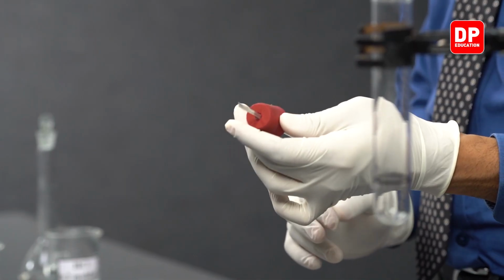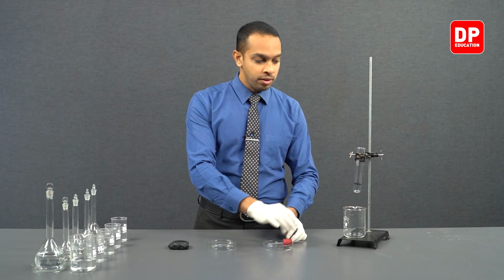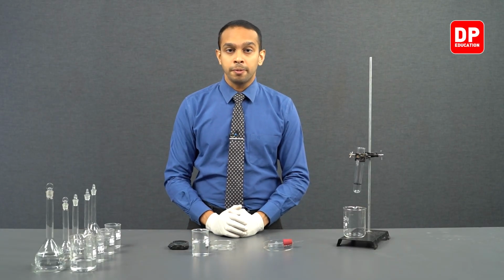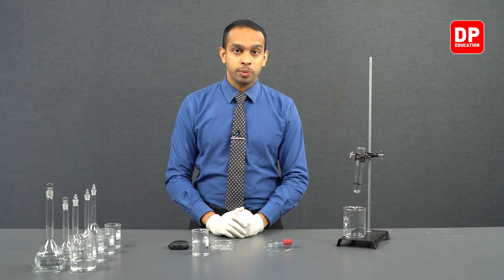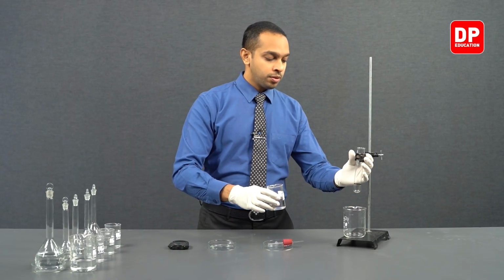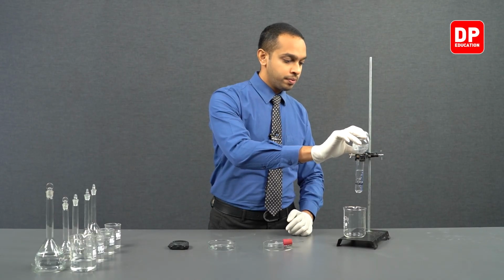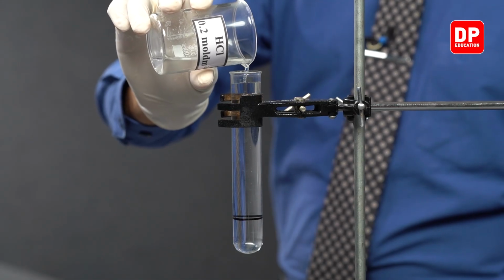After placing it securely on the rubber stopper, we are going to fill this boiling tube with 0.2 moles per decimeter cubed HCl. We have prepared this 0.2 moles per decimeter cubed HCl. We will fill this boiling tube all the way to the top with this 0.2 moles per decimeter cubed HCl solution.